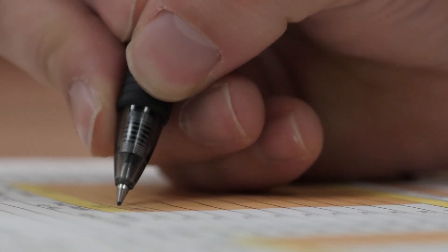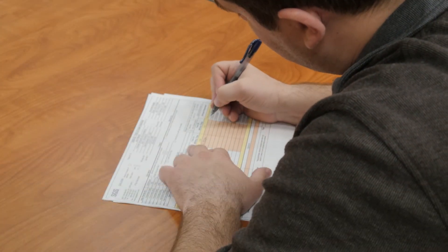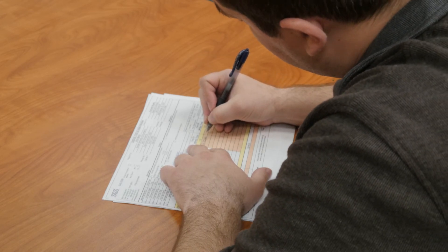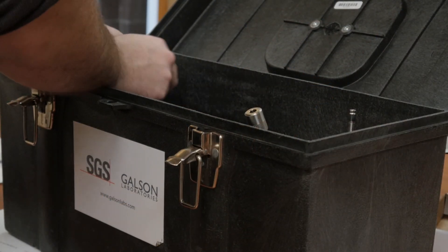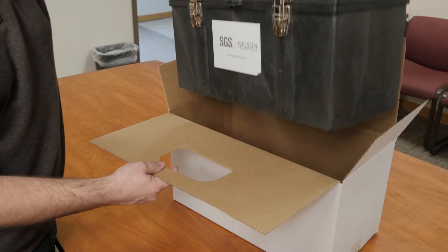Complete the shaded portions of the chain of custody forms. It is important that you include all the information requested in order to ensure the turnaround time of your samples. For the formaldehyde badge, be sure to list your field blank. Repack all instruments, equipment, accessories, and media in their original containers and ship back to SGS Galson.